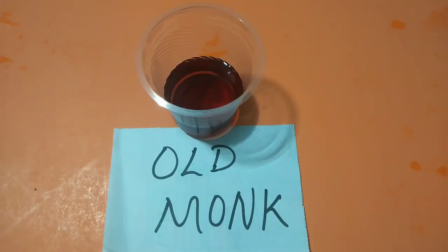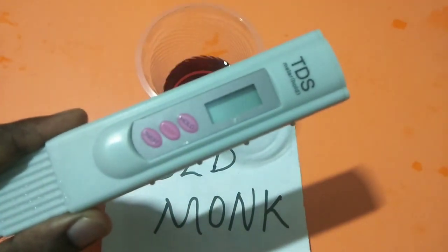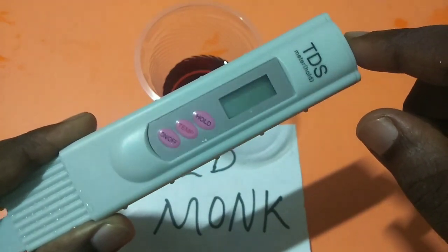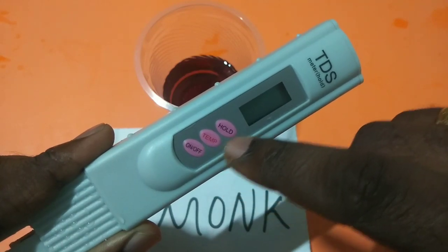Hey friends, so today I am going to check the TDS level of old monk. So here I am using this TDS meter to check the TDS level. You can buy this TDS meter from Amazon. You can see it has three buttons: on or off, temp, and hold.